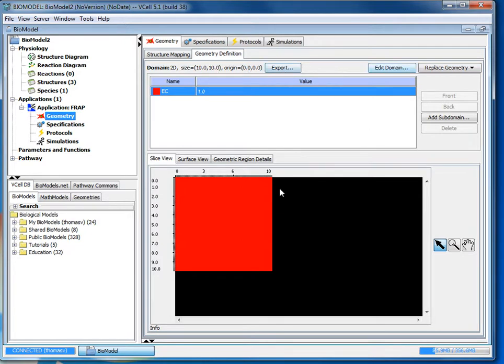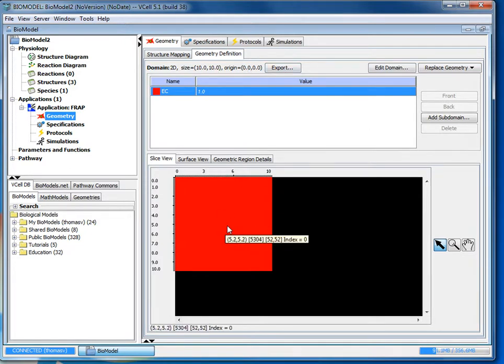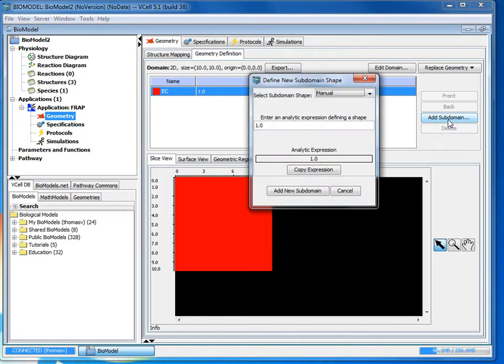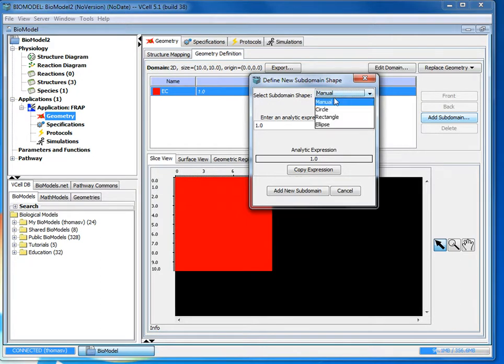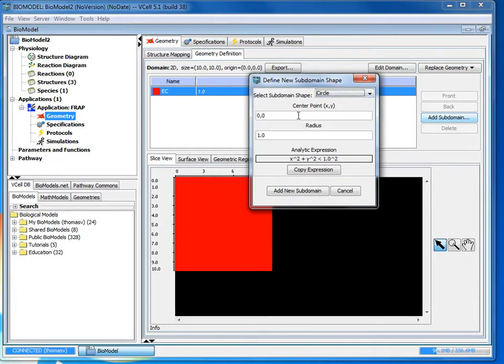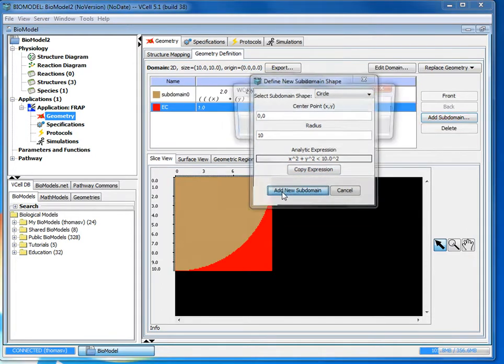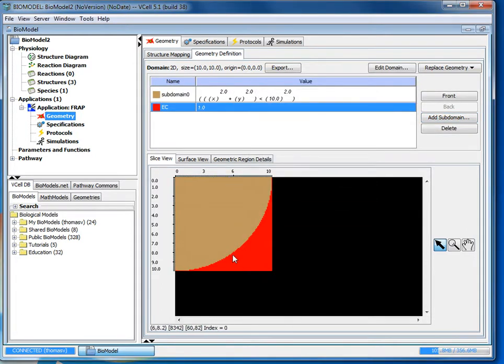After we created the extracellular region, we need to create the actual region for the cell. So go to add subdomain. And where it says select subdomain shape, choose circle, leave the center point at 0,0 and change the radius to 10. And you'll get a preview of the expression for the circle. And then if you click add new subdomain, it will create it for you.